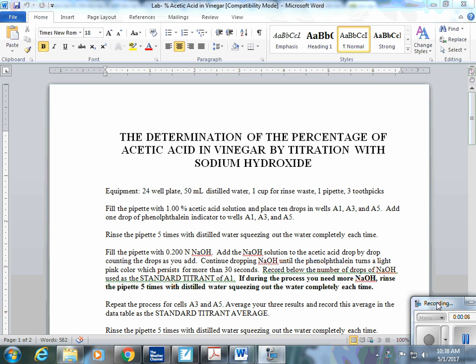Braun, and today we are doing the pre-lab video for the determination of the percentage of acetic acid in vinegar by the titration with sodium hydroxide. So basically, in layman's terms, what we're trying to do is figure out how much acetic acid is in vinegar. What percent of vinegar is acetic acid?